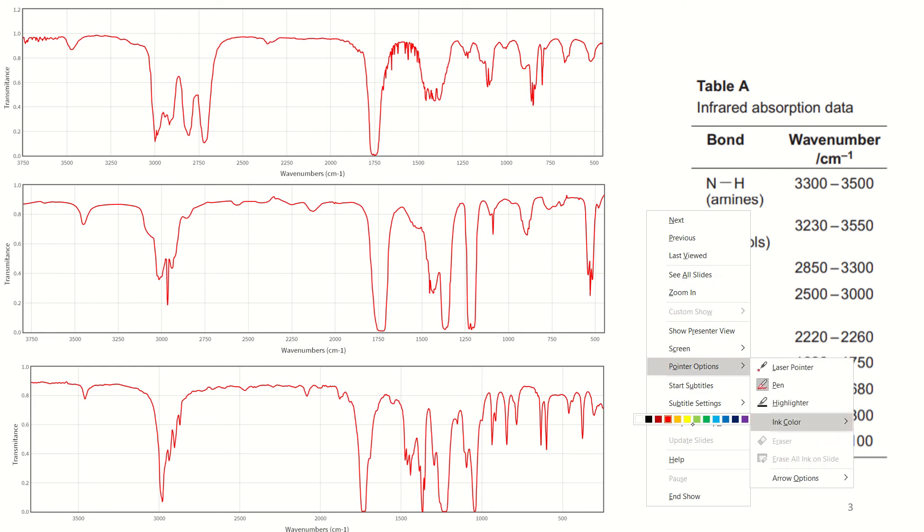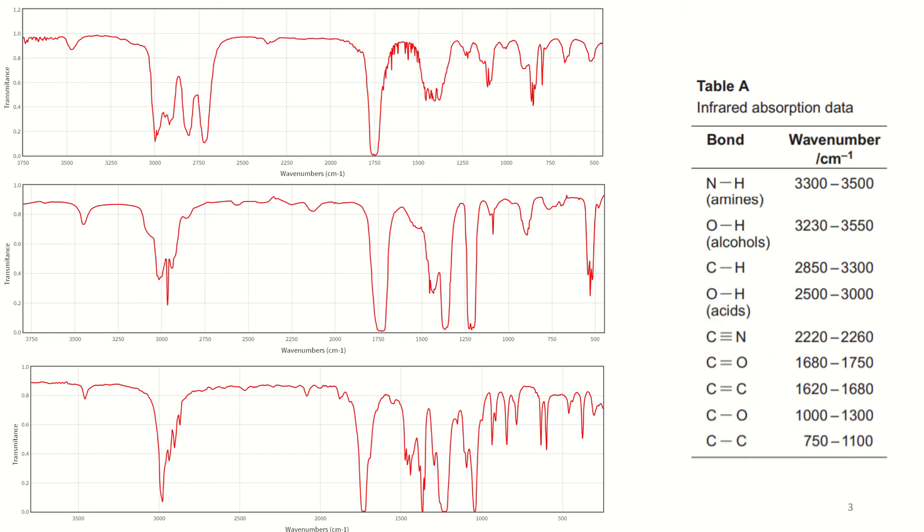Now three spectra that are quite hard to distinguish. What we've got here is an aldehyde, a ketone, and an ester. So an aldehyde group, ketone, and an ester. We can see they all have this carbonyl group. You can see double bond O, which I mentioned was the very sharp peak.